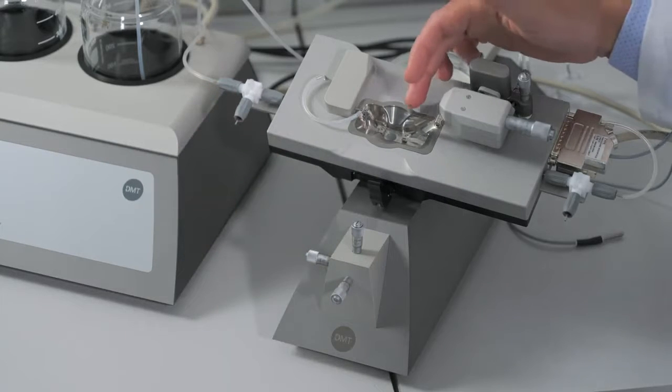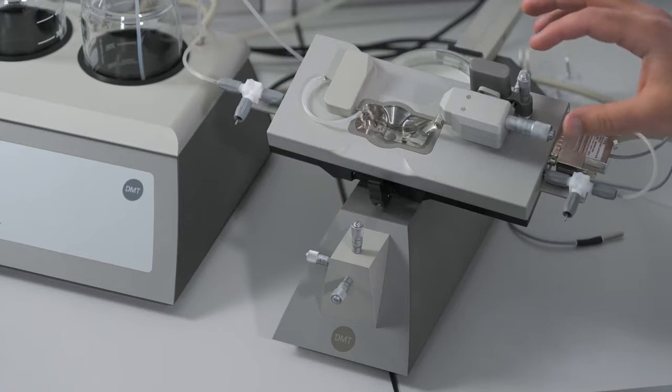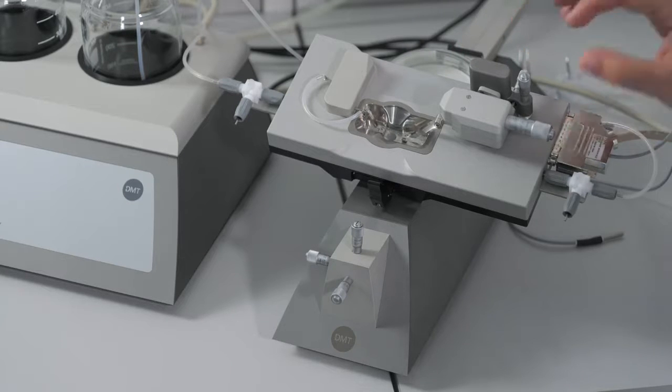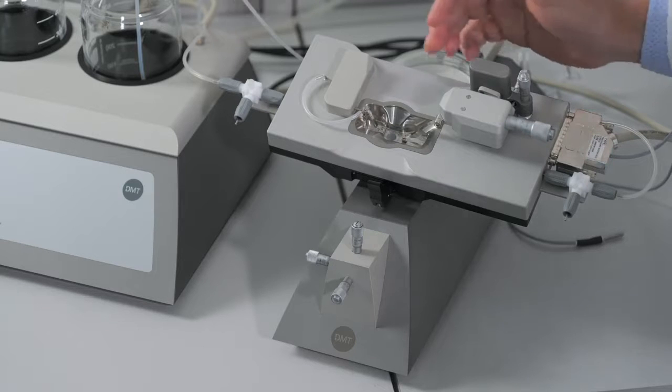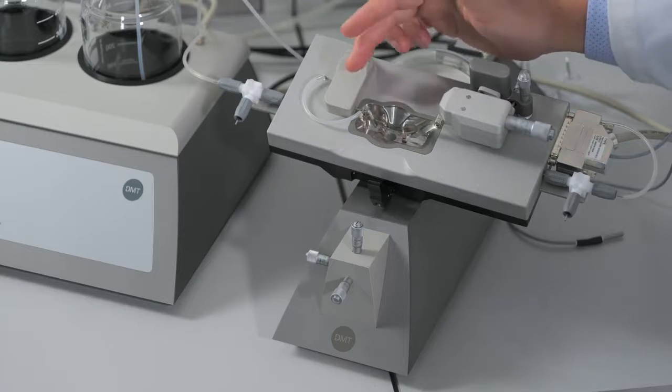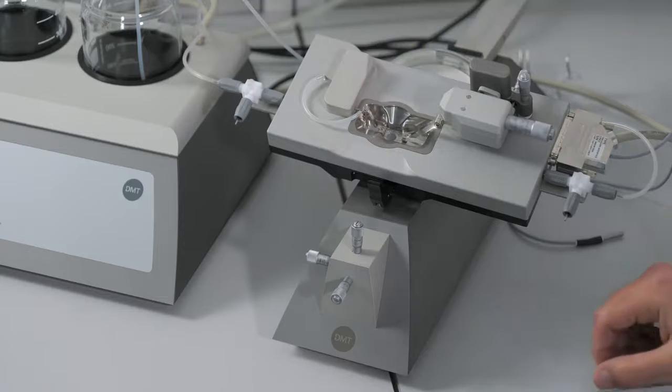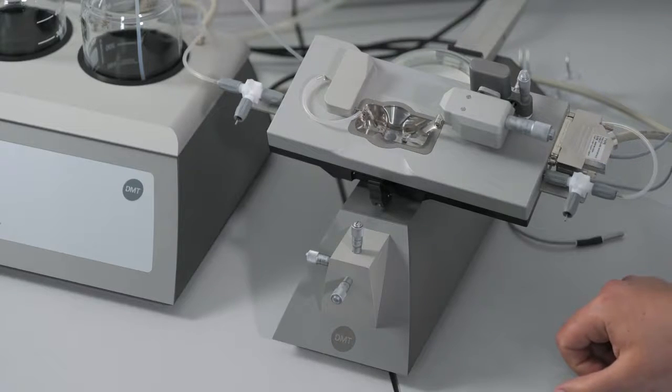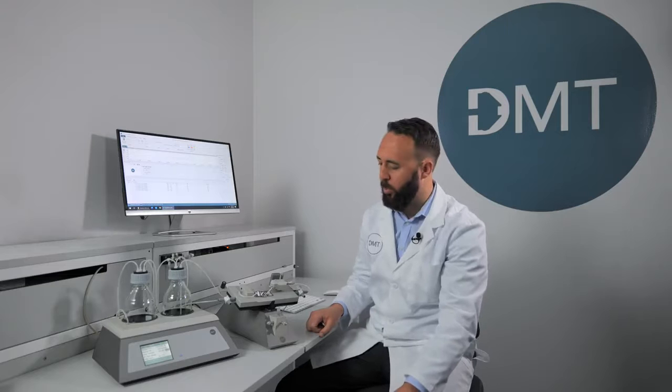The right side cannula holder is attached to three micropositioners that allow you to smoothly and easily align your cannulas, while the left cannula holder is connected to a force transducer that allows you to standardize the stretch between all vessels of your experimental group.